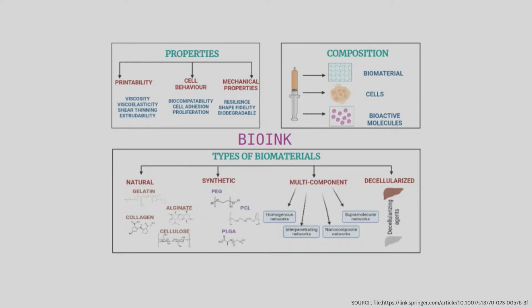You need to make your bioink of a certain optimal viscosity, which will enable you to print well. And also, once you're printing, it should be able to hold structure. So mechanical integrity of the bioink post-printing is also very important. Now, the printability out here, as I was saying, is defined by the viscosity of the bioink, by the viscoelastic nature of the bioink, shear thinning, and extrudability of the bioink. Now, these all parameters define if the ink that you have prepared is good to go for the next step or not. So out here, the bioink optimization step is involved.